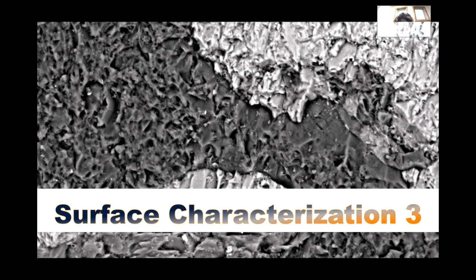And these electrons are backscattered electrons. And we'll actually mention the third flavor of electrons we use, which is secondary electrons. And I always refer to them as flavors for some reason. And so backscatter electron, we'll start talking about it now because we'll talk about it later, gives you elemental contrast because of the way the electron interacts with the atom, particularly the nucleus of the atom. And so higher atomic number or higher Z number elements give you higher brightness, basically.